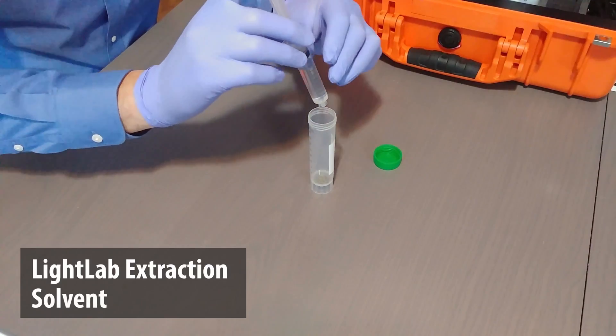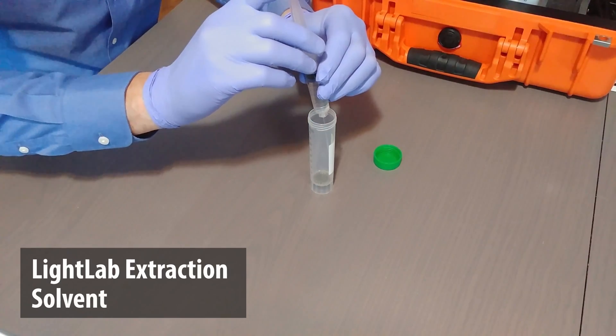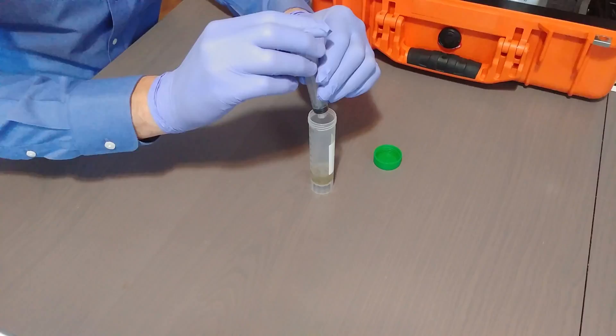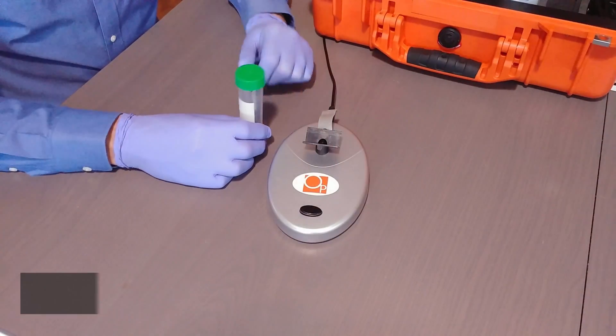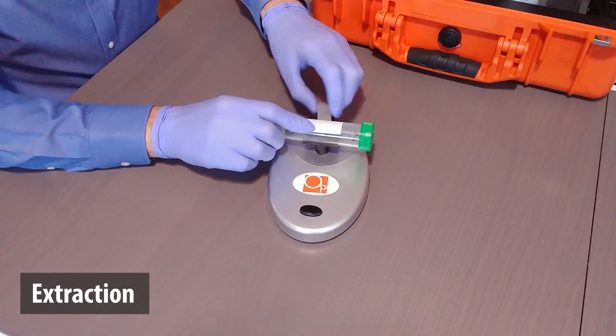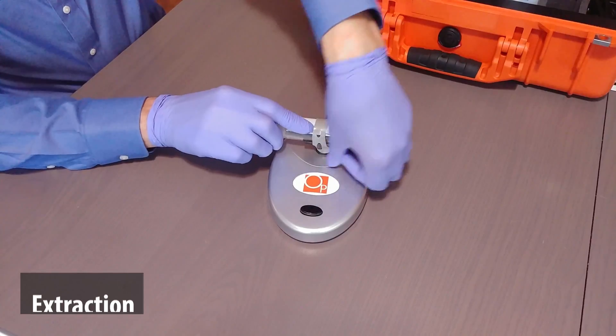Next we add LightLab extraction solvent. Then we mount the vial onto the LightLab shaker and turn it on.